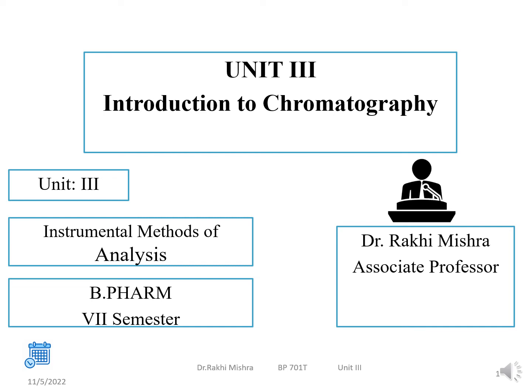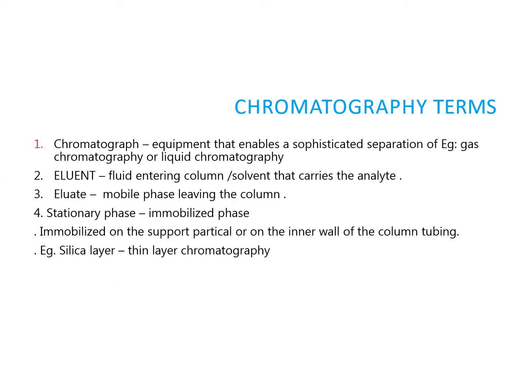Hello, my dear friends. In my second lecture of chromatography, we will discuss different chromatographic terms and the types of chromatography. In my first lecture, I discussed that chromatography components are mainly of two types: the stationary phase and the mobile phase. But to support the stationary phase, we need a supporting medium. So there are some terms.